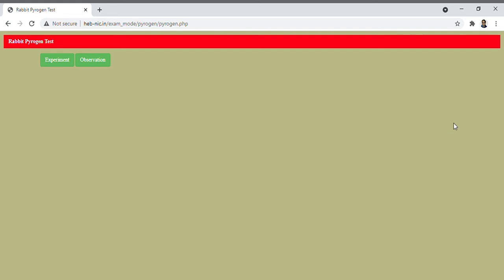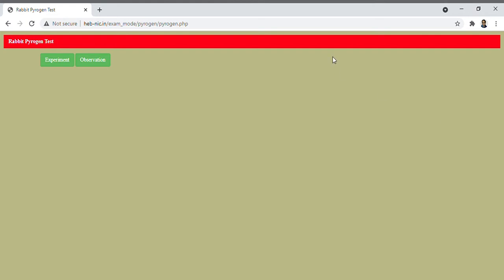I am Dr. Samir Shavan and in this video we discuss rabbit pyrogen test with the help of EGS form software.